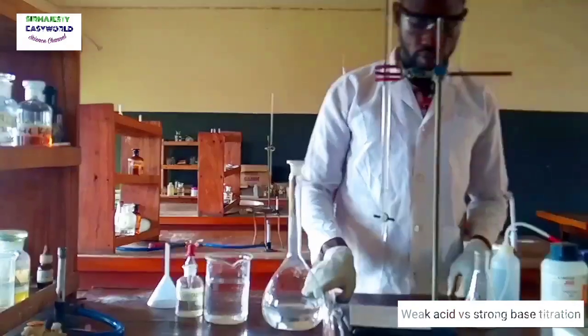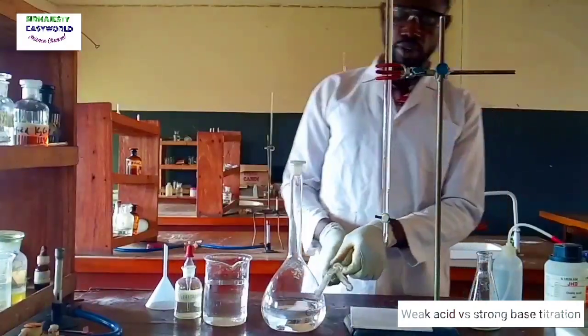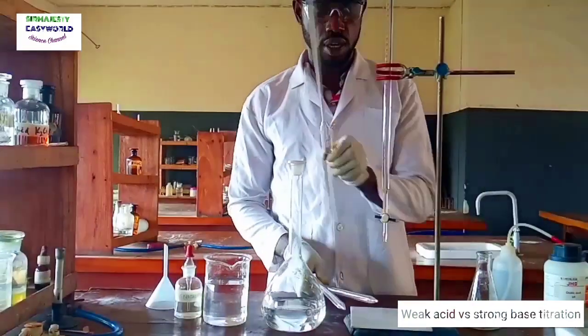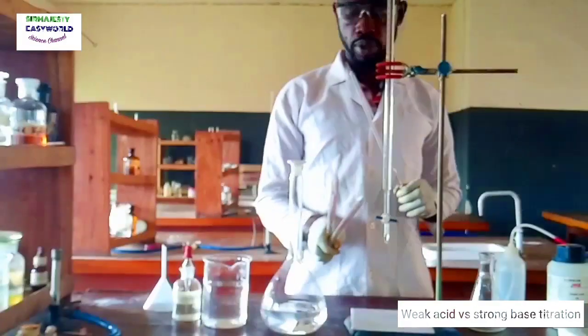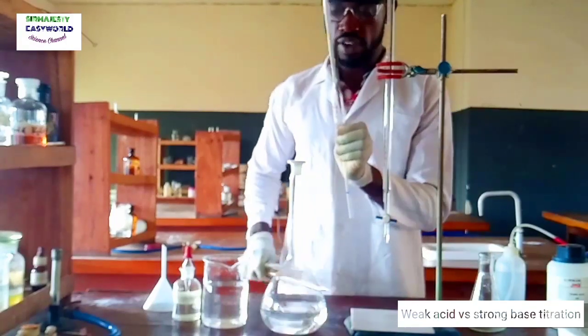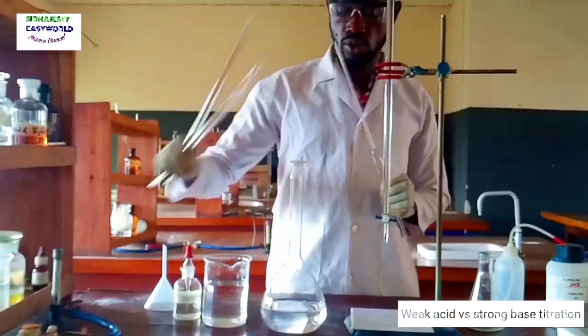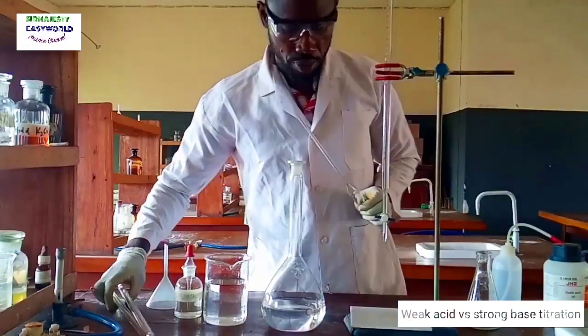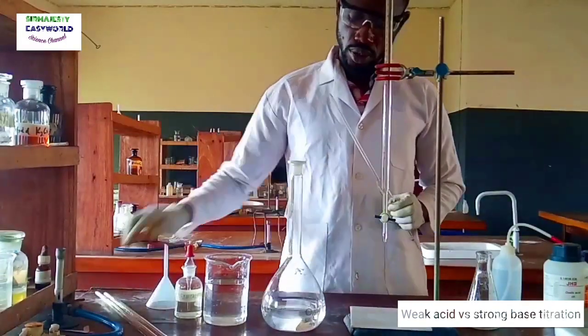I have my pipette prepared here — the volumetric pipette which is 25 cm³ and the graduated pipette. I hope that contains the correct volume. Here it's 20.